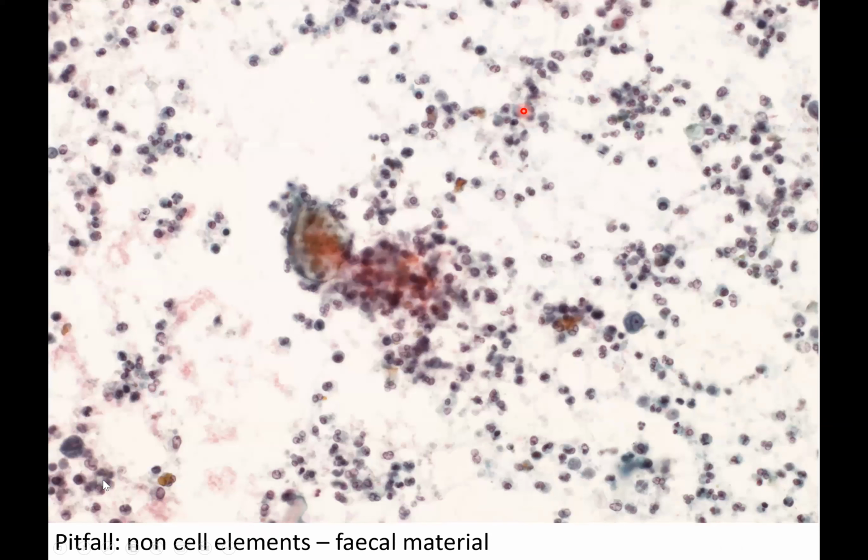Finally, we mustn't forget the pitfall of non-cellular elements. In this case, the fluid shows fecal material following an intestinal perforation.